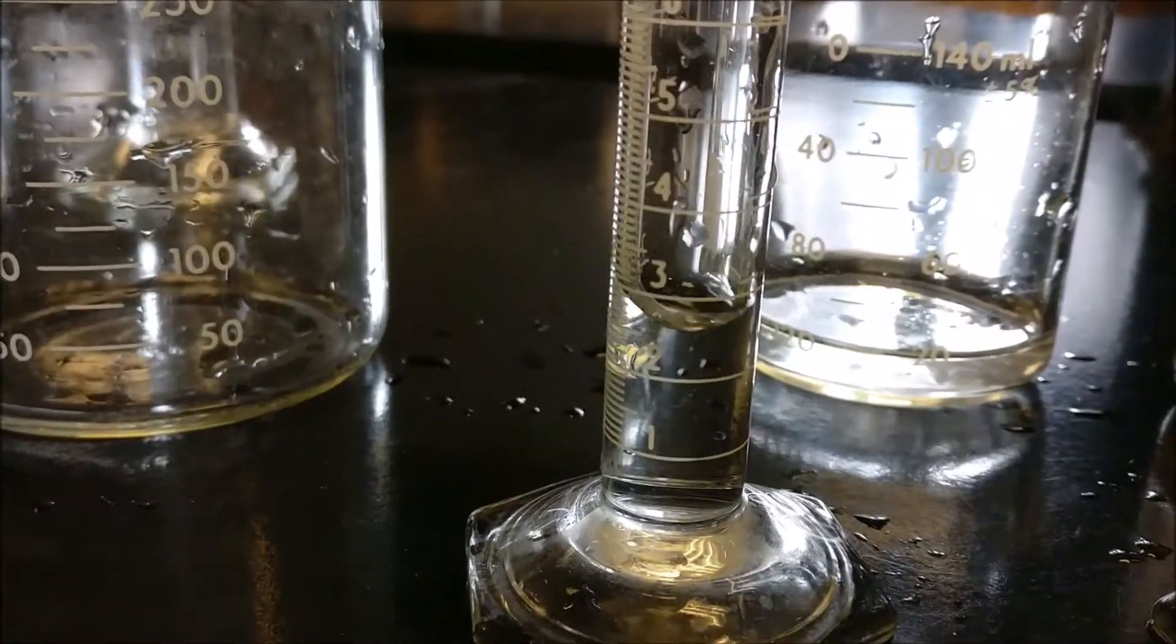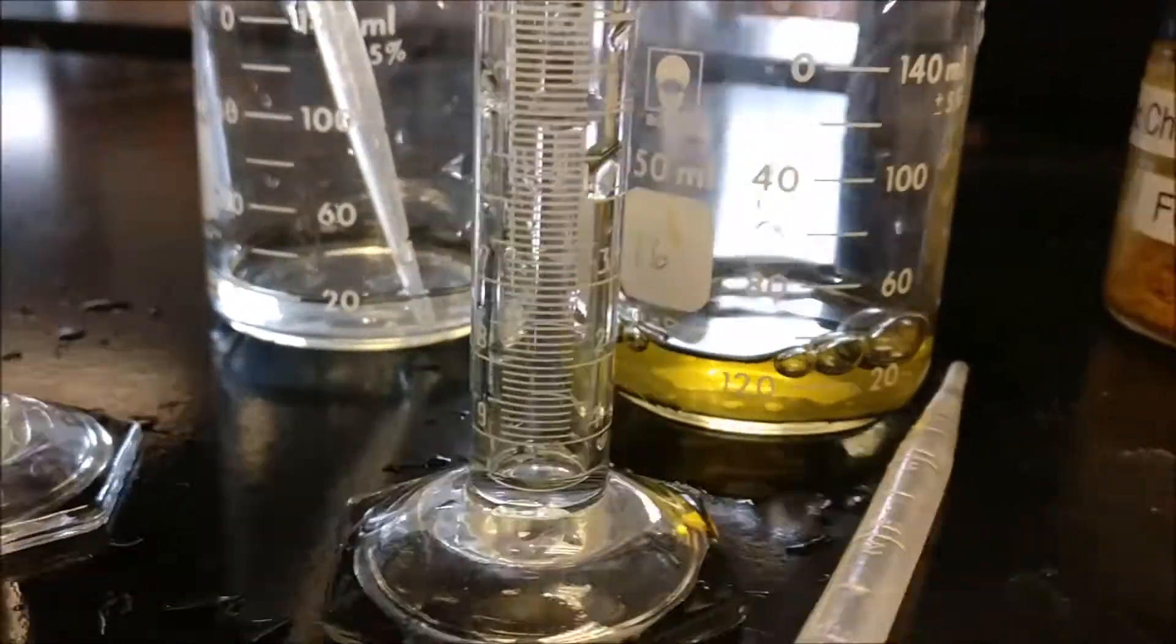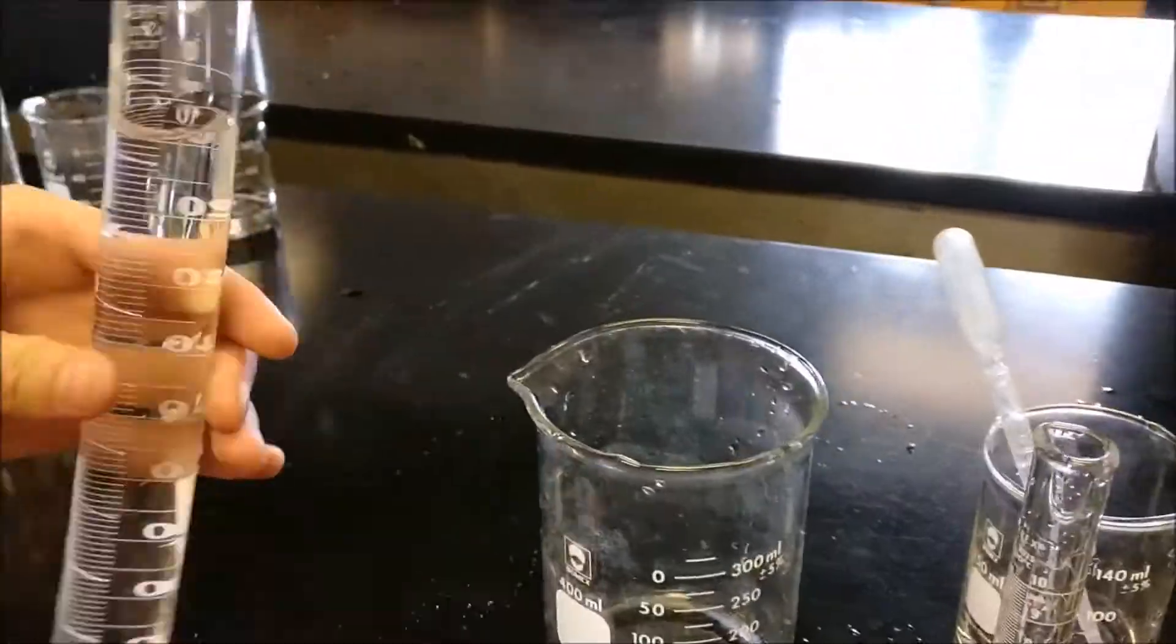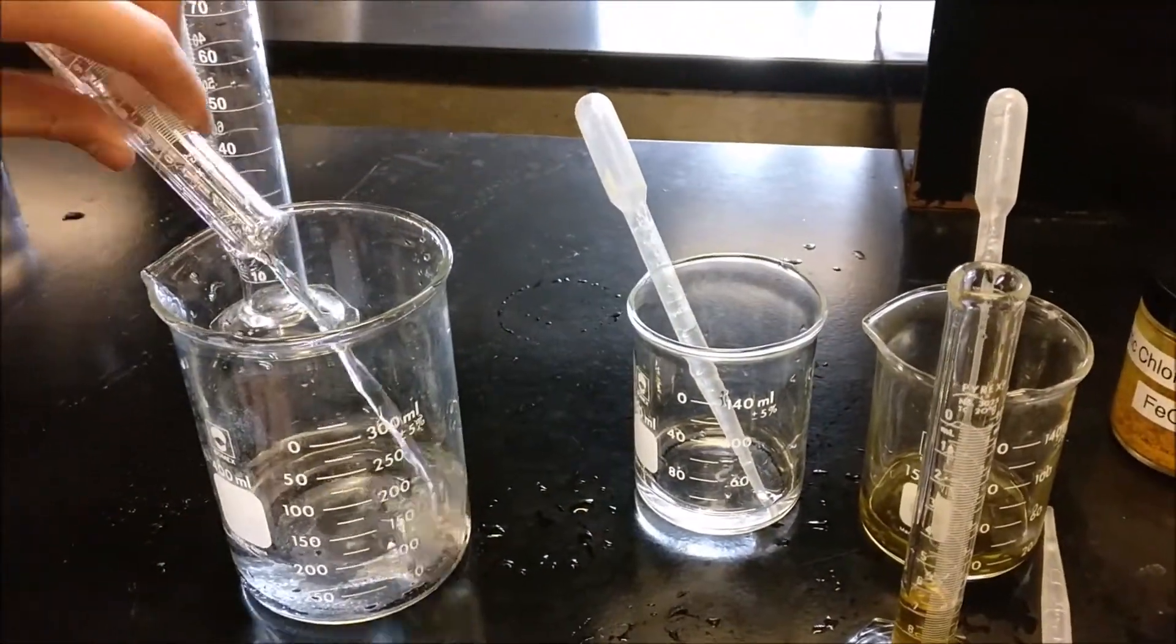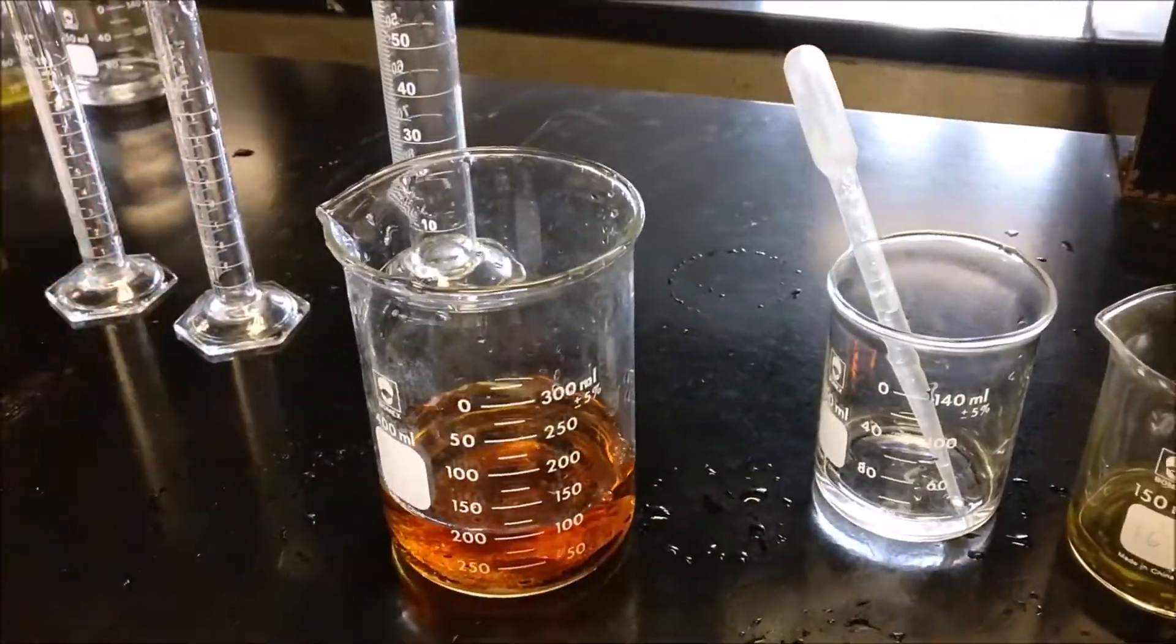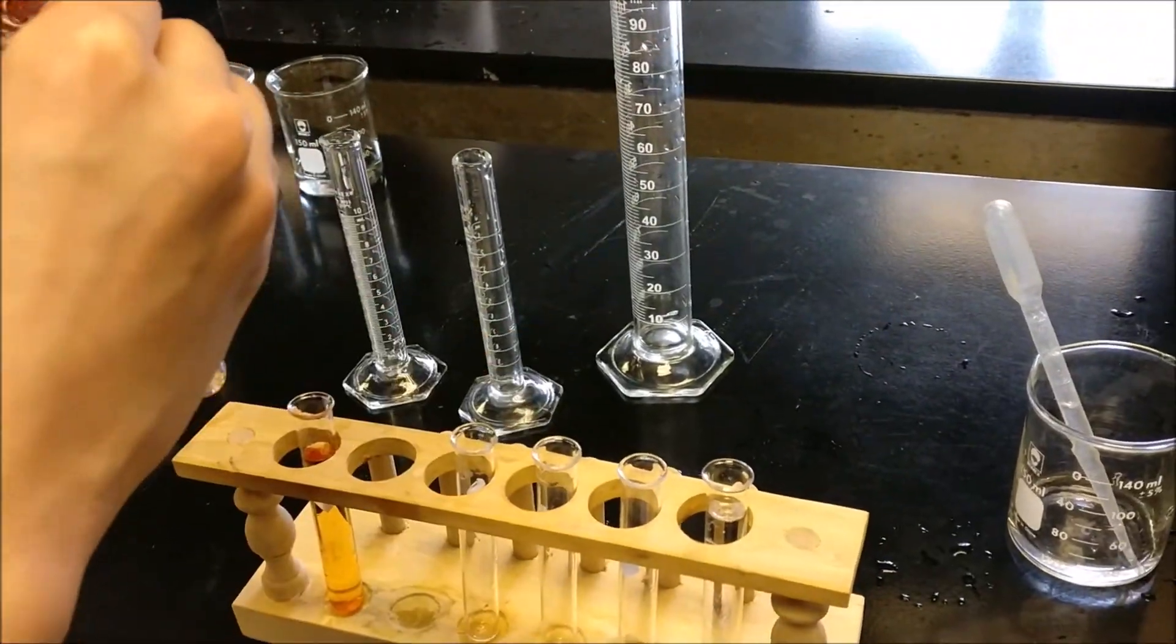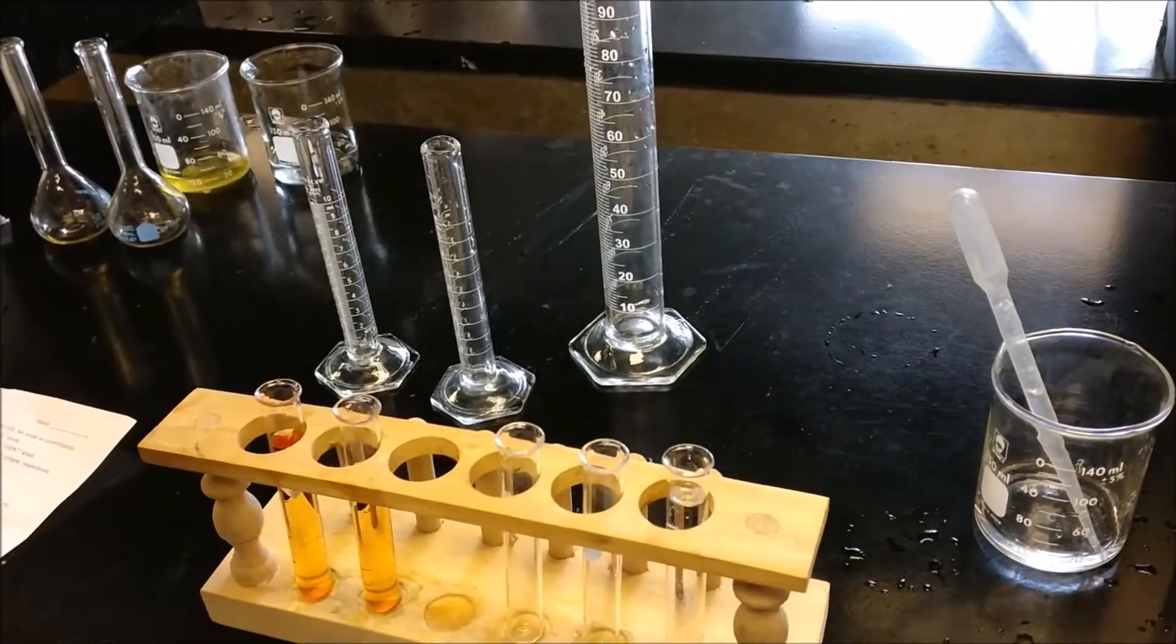First, make the solution from trial 3 again which requires 3 ml of sodium thiocyanate and 3 ml of iron-3-chloride and 94 ml of water. Then distribute the solution into five test tubes, filling each about one half to three quarters full.